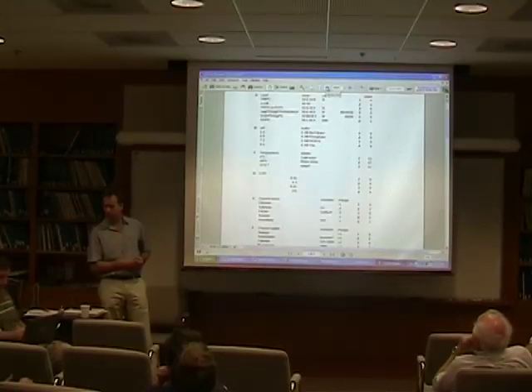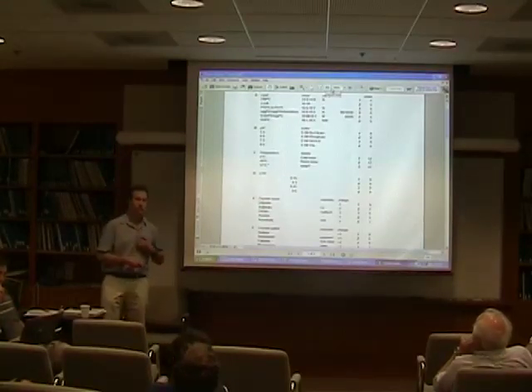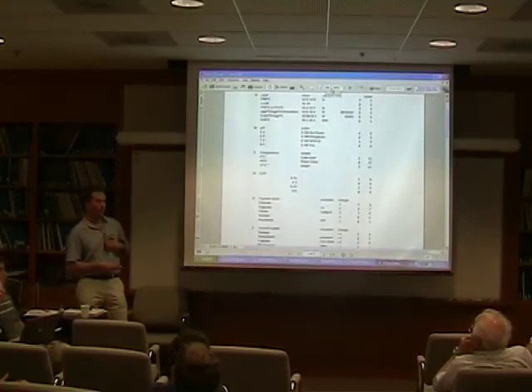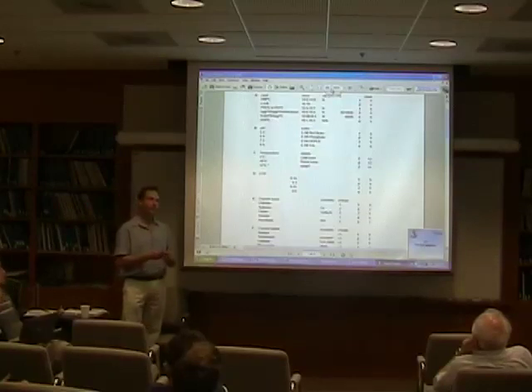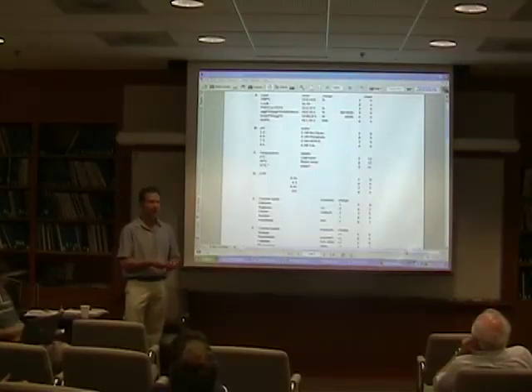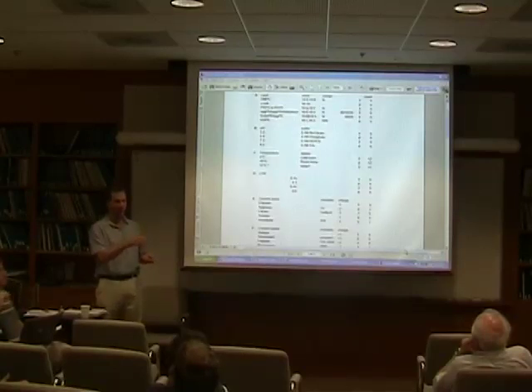Okay. So how do you distinguish between the counter anion and the counter cation? Because if you bring in a salt, you will have both in. Yeah, you can take a range of salts, like calcium chloride, calcium sulfate, and mix. If you talk about independent parameters, how do you distinguish between the activity of the anion and of the cation? Because if you have, for example, magnesium chloride, magnesium sulfate, calcium chloride, and calcium sulfate, then you can treat everything that has been done with magnesium as one, everything that's been done with calcium as one, and ask: is it magnesium or calcium? And the same way you can say everything with chloride, everything with sulfate.